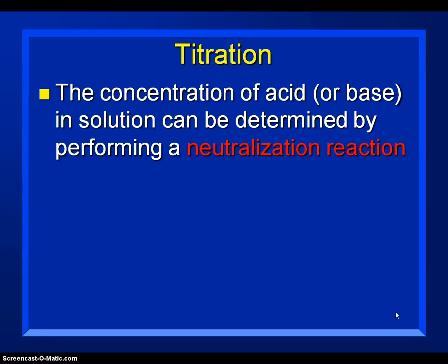So in this video I'm going to discuss neutralization and titration. Titration is a laboratory method in which we can determine the concentration of an acid or a base with another acid or a base by utilizing a neutralization reaction.